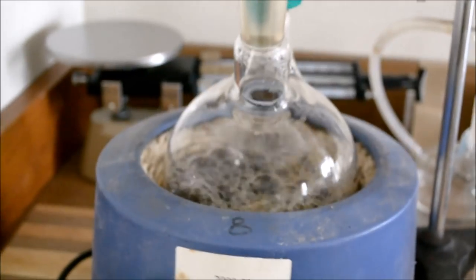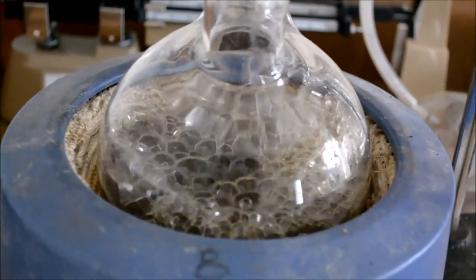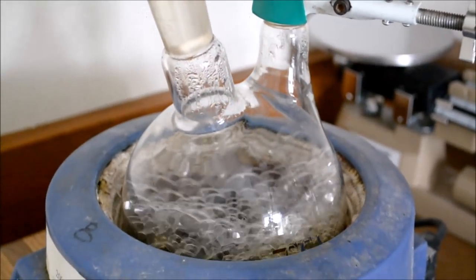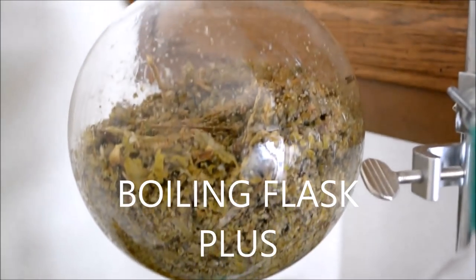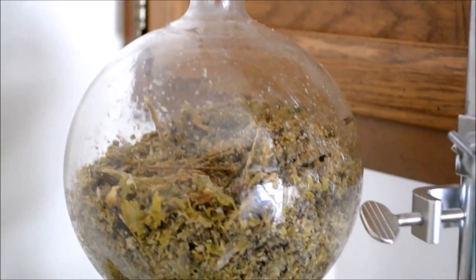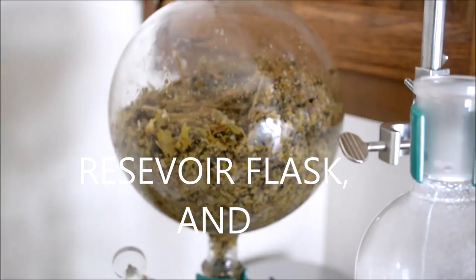Beyond that, you have the boiling flask. As we can see here, the water is boiling consistently, so that is the boiling flask. From the boiling flask you have the reservoir flask, and it's pretty self-explanatory. That's where your herb reserves are held so the steam can go through.